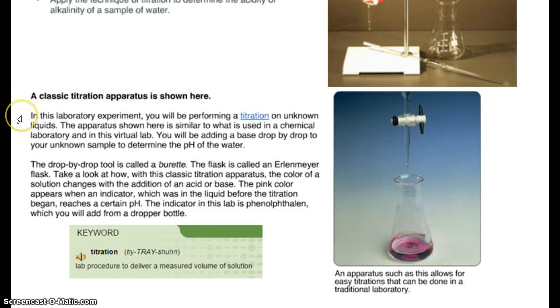A classic titration apparatus is shown here. In this lab experiment, you will be performing a titration on unknown liquids. So titration, a lab procedure to deliver a measured volume of solution. In other words, we want to know exactly how many drops and therefore how many milliliters of the solution we're adding from the burette into the flask. The apparatus shown here is similar to what is used in chemical laboratory and in this virtual lab. You'll be adding a base drop-by-drop to your unknown sample to determine the pH of the solution. It says water, but water is usually 7.0, so we're going to use it for a solution. The drop-by-drop tool is called a burette. The flask is called an Erlenmeyer flask. Take a look at how, with this classic titration apparatus, the color of a solution changes with the addition of an acid and base. So it started out clear, and now it's going to be pink.